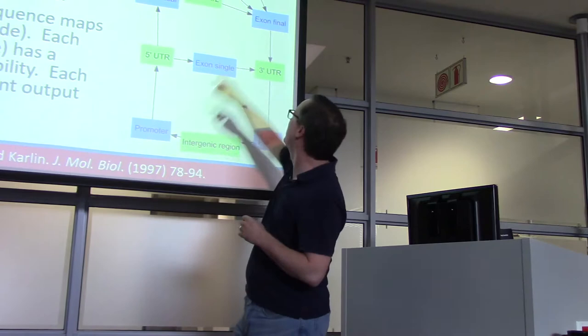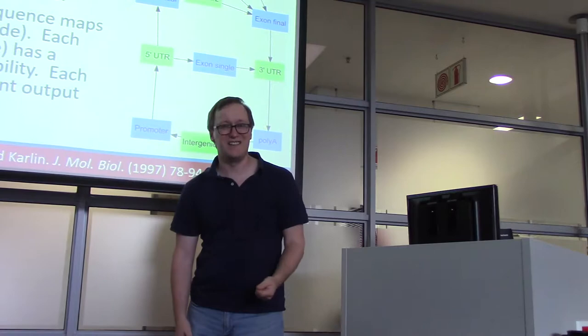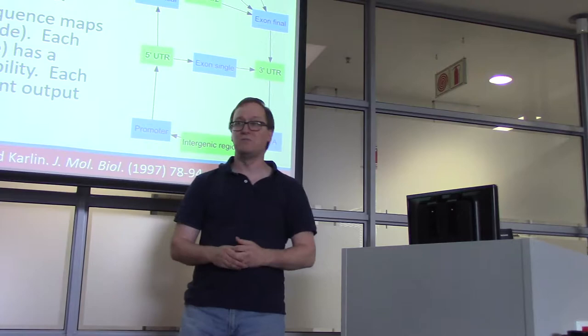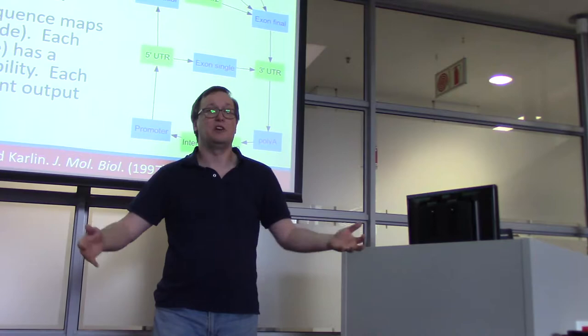Happily, we can rely on software to untangle what the exon structure is for a gene, because doing this manually took a long time. It took a really long time for those very first genes to be picked out. So hidden Markov models are our way of finding more features that look like ones that we've seen in the past. You've got 500 gene structures that you've worked out meticulously by hand. You can train a hidden Markov model on it and then run it against the rest of the genomic sequence to tell you where the other genes are that follow the same constraints.